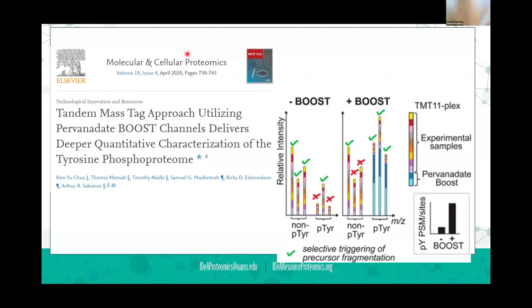And so Art and Shin had the idea that we could do this with phosphotyrosine. We could take a cell and treat it with pervanadate to inhibit phosphatases. And if you do that, you artificially raise the level of phosphotyrosine in that cell. And now you've got a cell lysate that has 10-fold or higher levels of phosphotyrosine. And so we did that and went through a series of experiments and showed that it indeed did work, and allowed us to identify and quantify more proteins.